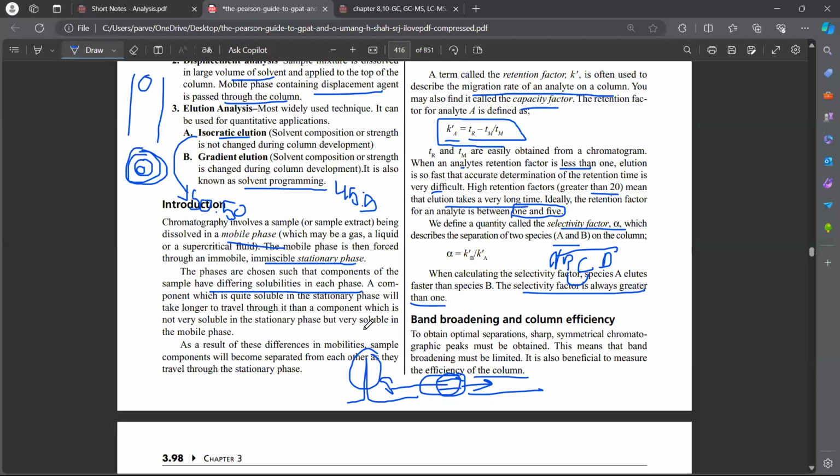Yeah. Because the mobile phase flows at such a high pressure to the HPLC column, as the name signifies, HPLC is also known as high pressure liquid chromatography. So during the high pressure, if there is any air entrapment in the mobile phase, it may lead to formation of bubbles within the column, which can significantly increase the pressure within the column, and it can damage the column. So that's why whatever mobile phases are used for the HPLC are properly filtered, properly degassed, and special grade solvents are used which are free from impurities.